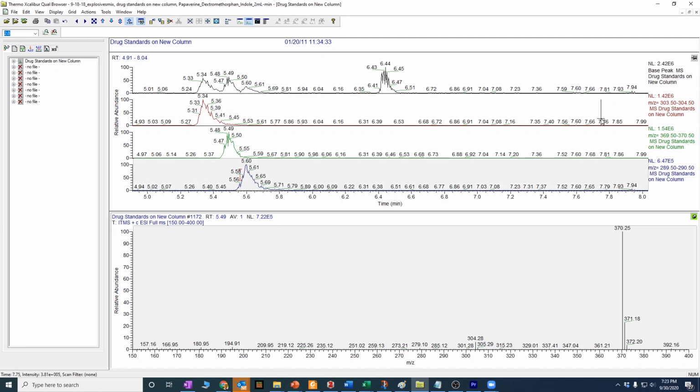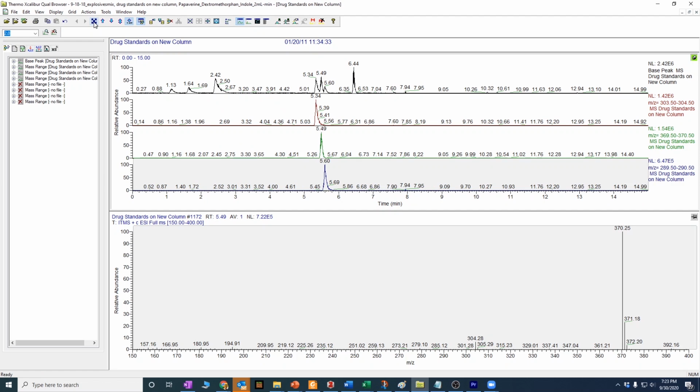So the mass spectrometer is really powerful in concert with chromatography. And that's going to be the most popular instrument in all of forensics, actually, is combining mass spectrometers with chromatography. The GCMS is the most popular for most of drug chemistry. LCMS is the most popular for forensic toxicology.